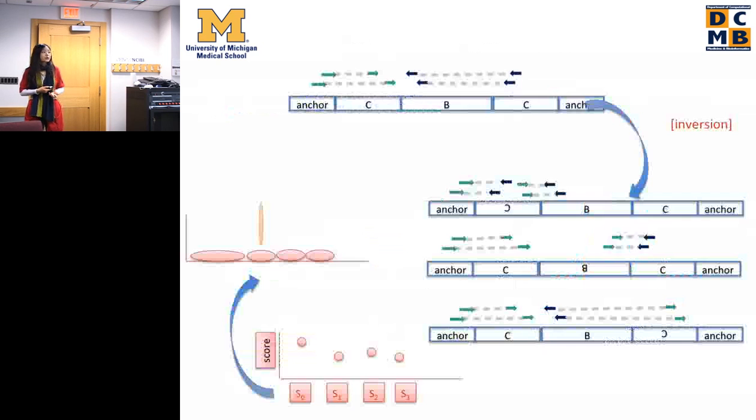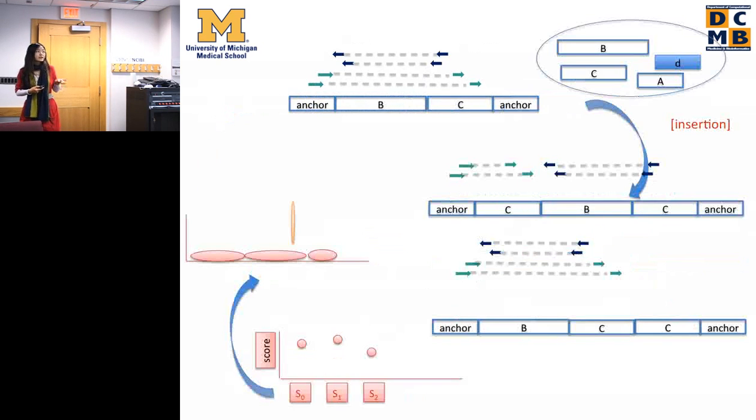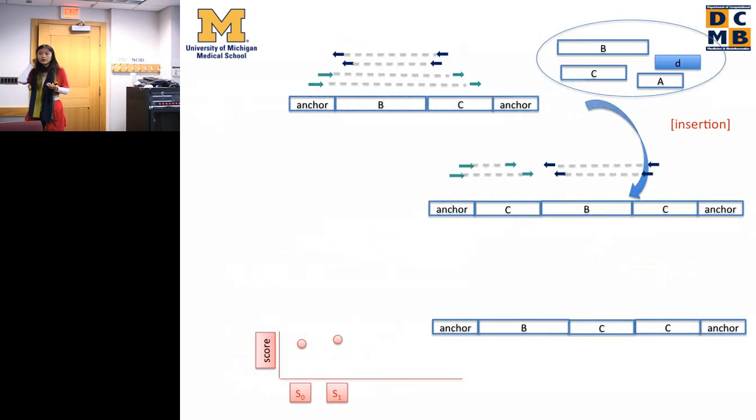Of all the breakpoints we could detect, compared to the already defined simple deletions, we could find around 70 or 80% of them. Within the file itself, there is around 10% false positive. So in total, we may be able to get 80 or 90% accuracy in defining the breakpoint.